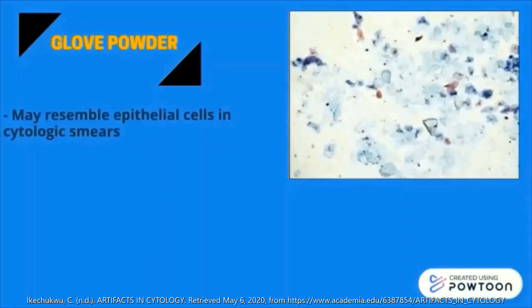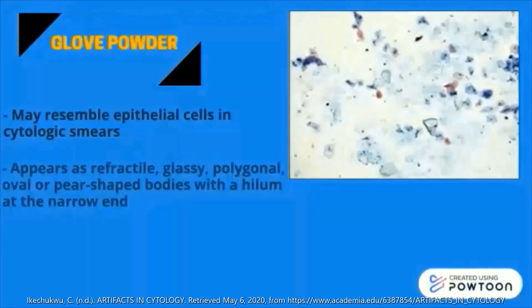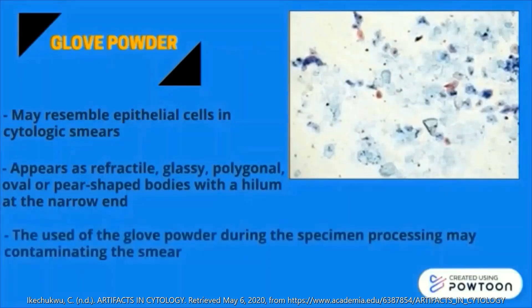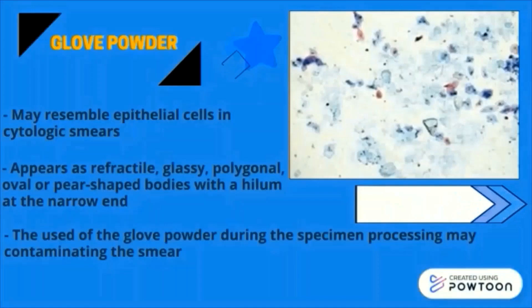Glove powder may resemble epithelial cells in cytologic smears. It appears refractile, glassy, and polygonal with a hilum at the narrow end. The use of glove powder should be avoided because it may contaminate the smear.